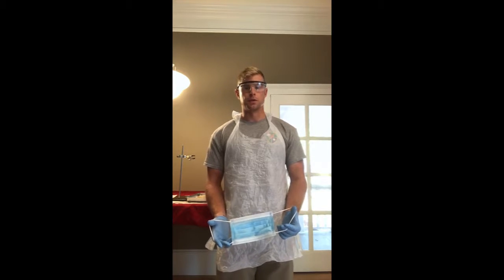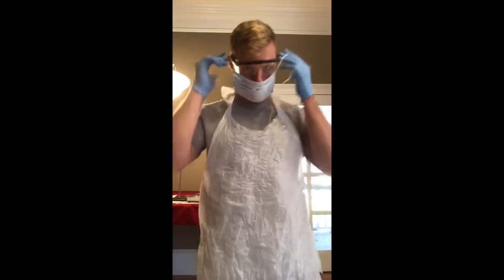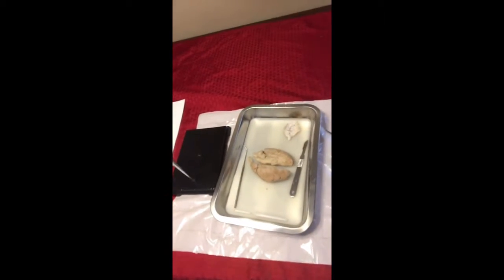I will be doing the sheep brain dissection today, and I will show you my workspace now. I don't have someone to hold the camera for me, so I have an apparatus for holding it here above my workstation, and I do have the notes for the structures list, as you can see.